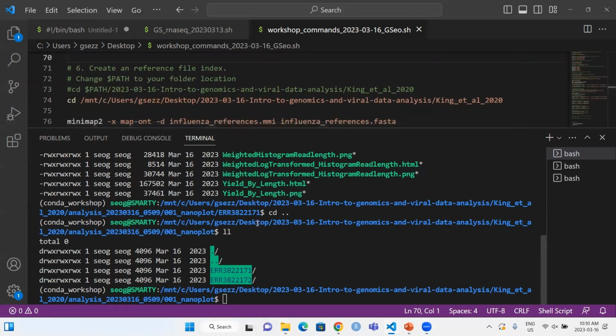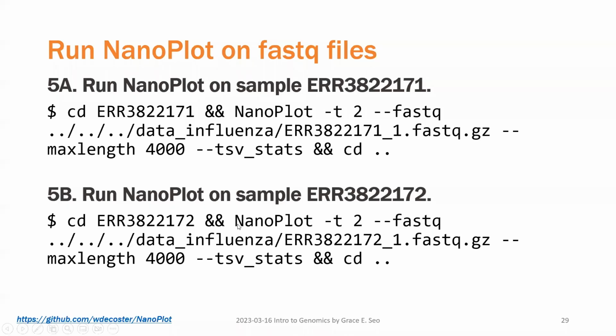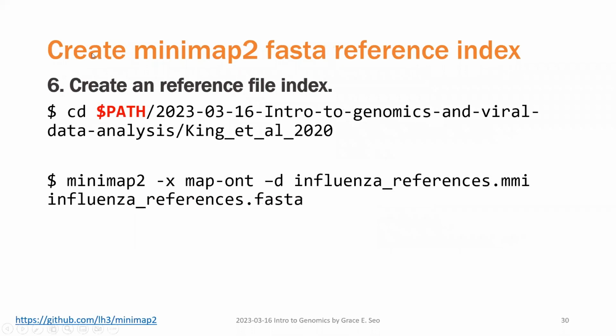Okay, now we're going into the Minimap2 data analysis. If you need the plot or the code, the slides have the code already for the second one as well. Minimap2 is our reference read mapping tool that we're going to use.